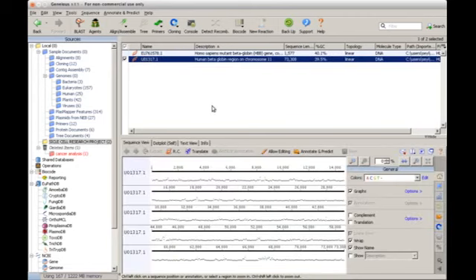So you will click on the human beta globin region on chromosome 11. So I will click on it, and then I want to understand the nature and the DNA makeup of this sequence. I want to understand it, and that is DNA analysis for you. Now this is to give you a general note and understanding of what you want to work on. You understand?